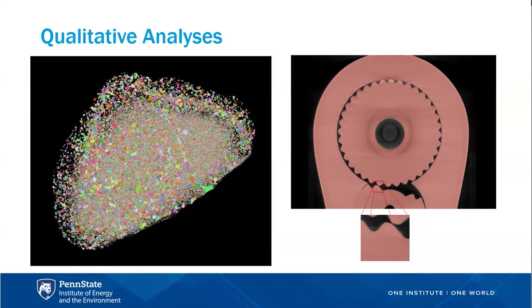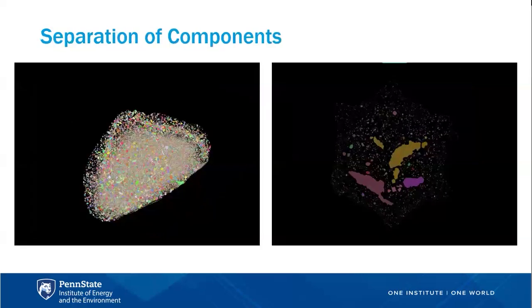There's other things I've done. We've done soil sampling and we scanned it. And then there was one sample where 50 to 75% was a single stone out of the sample, which isn't very useful. And so we knew right away that we couldn't use that. So if you need some real quick qualitative information, something's going odd, you don't really know what it's doing, a scan may actually be really helpful for you.